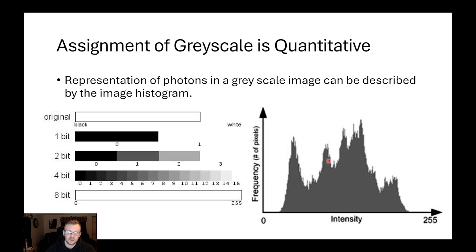We can go over here to this next peak. We again get a lot of pixels that are assigned to this kind of intermediate mid-range intensity value, and we can interpret that as maybe a protein localized to a certain spot, maybe an aggregate of proteins that are not fully folded correctly, so we don't get the correct emission spectra of the protein. There can be a lot of things that drive that.